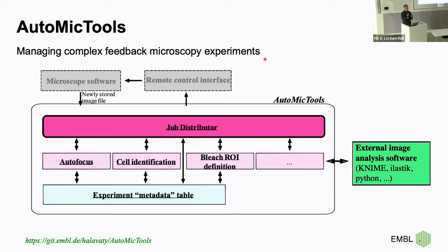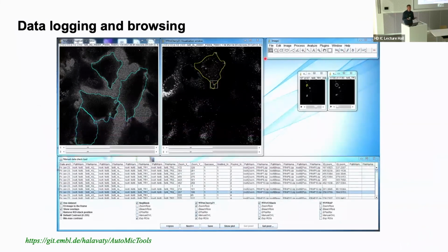In other ways, coupling your images or image files to the decisions made in a tabular format, which can be used for browsing and for analyzing the images. And then this is linked to a simple browser, which can be used to browse through the images and see that. This is just an example of how it will work.